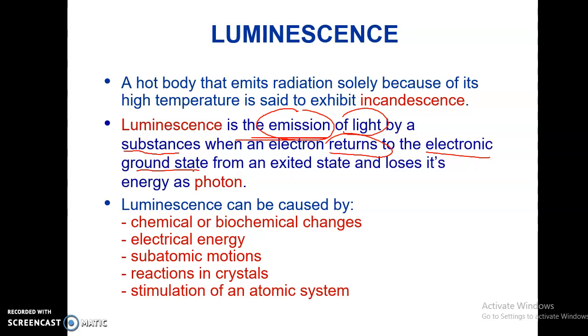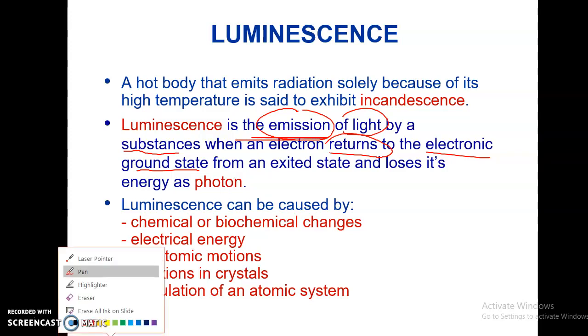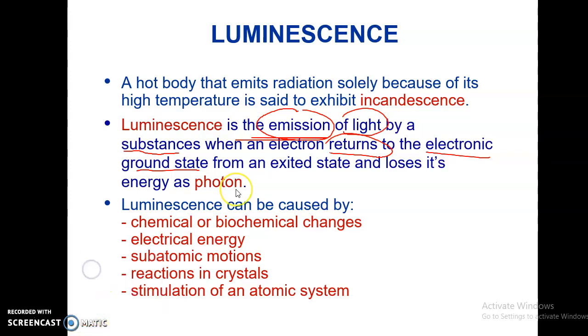Nothing after that, we didn't analyze anything after that. Whereas in fluorescence, we are analyzing the emission after absorption from ground state to excited state, and when that energy wants to reduce back to ground state, it emits something.